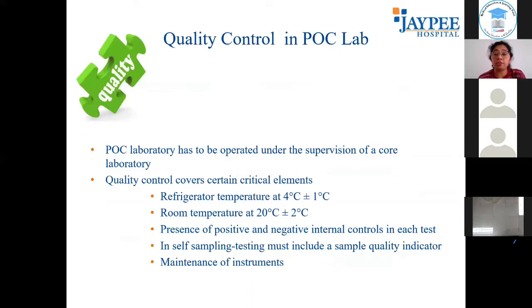And I think Dr. Neeraj has already dealt with quality in a POCT lab, but in a microbiology lab, it is very important that you do a quality check of your biosafety cabinet, you maintain the temperature, record the temperature of your refrigerator, room temperature, because most of your kits you will be preserving at room temperature. So the temperature of the room has also to be monitored, including controls, positive and negative control. That's always a challenge. How many controls, what controls? Please make a decision, make a plan for your QC, how frequently you would want to run, what would fulfill the need of the manufacturer and what has the manufacturer recommended.